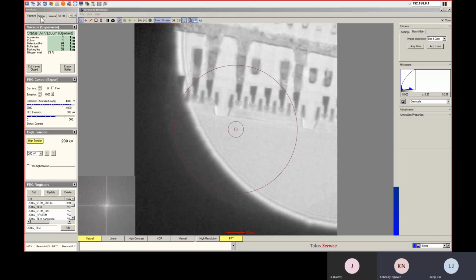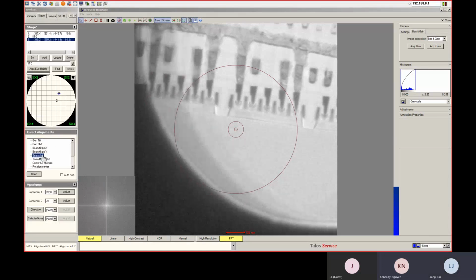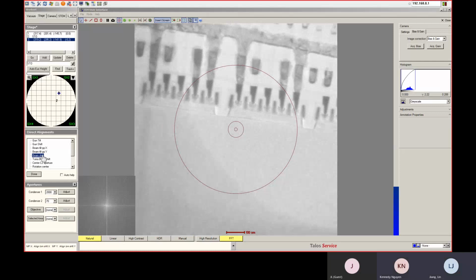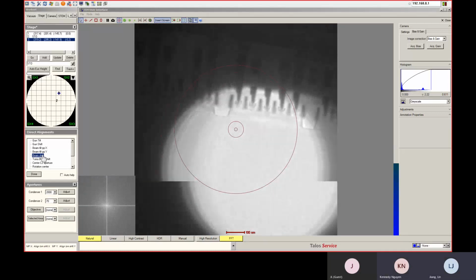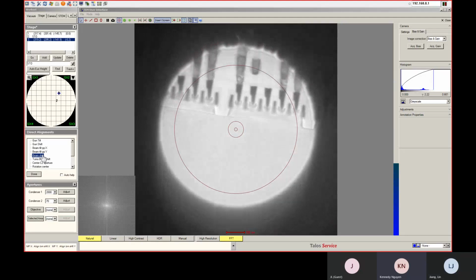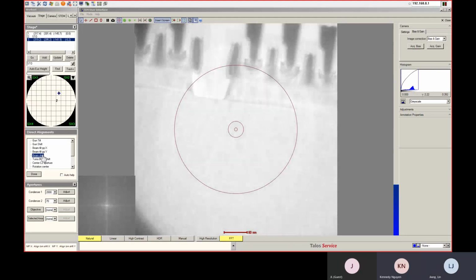So 1 would have more beam current than 3, right? Yeah. It's the same relationship as spot size, right? Yeah. So spot size 1 has more. Yeah, you're right. Exactly.